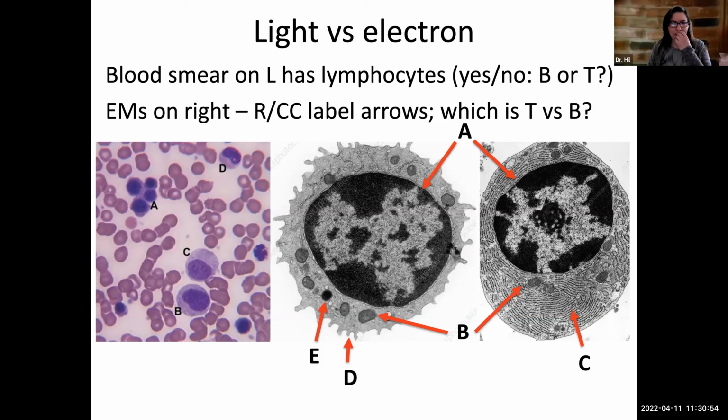Let's talk about what this stuff inside could be, because it's clearly different, right? A major difference between these cell types is how much all this googly wiggly stuff inside the cytoplasm is inside of this cell versus that one. What do you think this stuff is? All of these squiggly membranes, what's that?